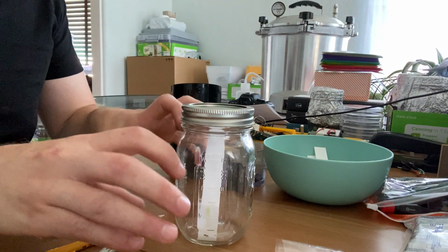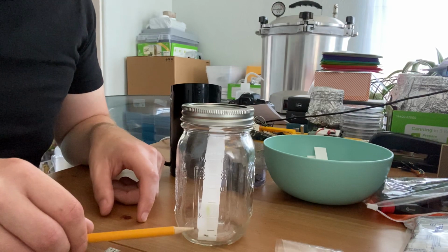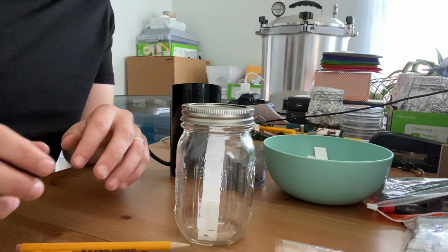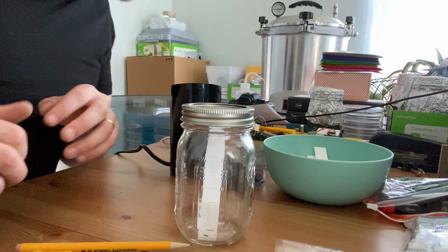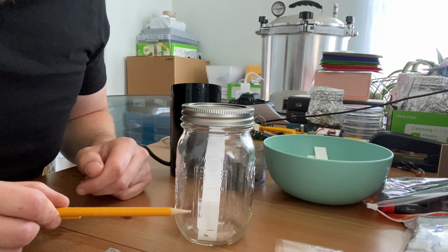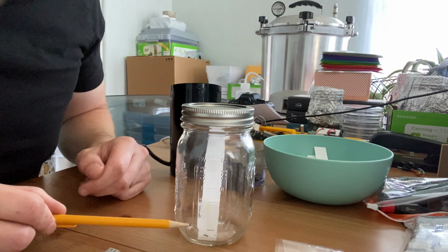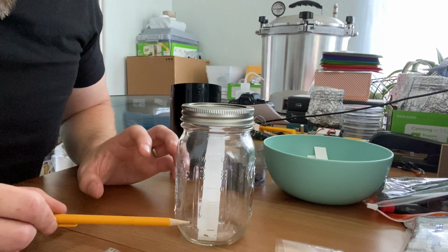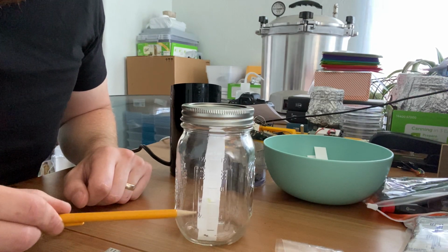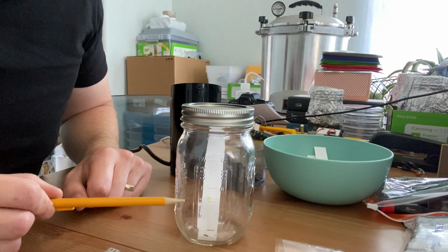So imagine if you could zoom into the molecular level: that acetone was sucked up by this paper, and it hit the oils in the extract, and the extract has a lot of different compounds in it, like chlorophyll and different kinds of chlorophyll, and anthocyanin and carotenoids and all kinds of things that frankly I don't know a lot about. But because they have different solubility and different polarity, they are being stretched, and some of them will attach themselves to the stationary phase, which is the strip, quite strongly, and so they don't travel as high up. And other ones, they're not quite as polar, so they can get pulled up quite easily.